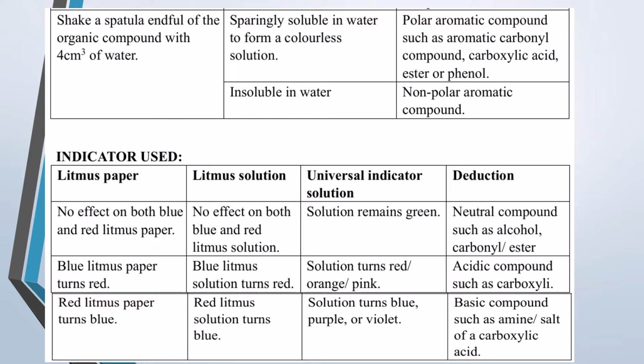So looking for solids, this is the observation you're going to be mainly making. I say that this one is not going to be considered for your level, or it's going to be nullified currently, because we do not have any compound that is completely insoluble in water. Rather, we have compounds that are sparingly soluble in water.